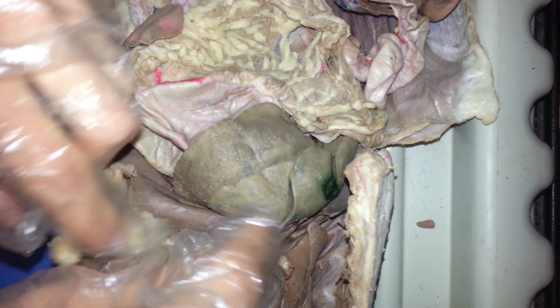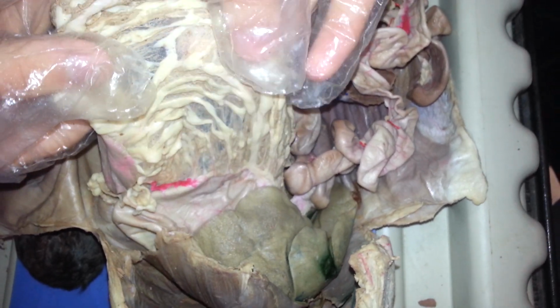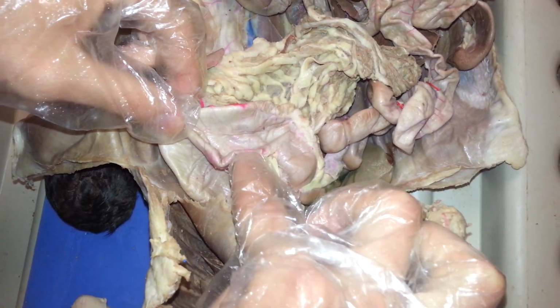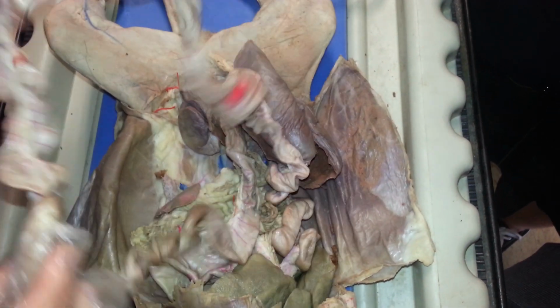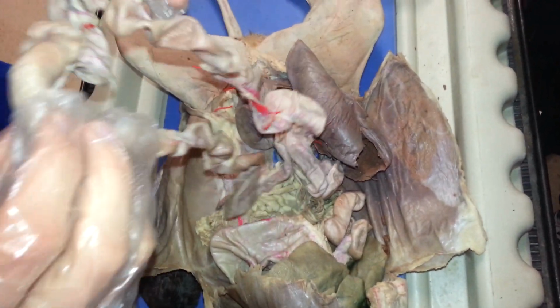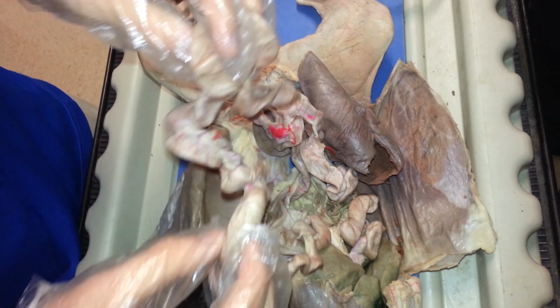Alright, next is the liver, so we're going to move on to the abdominal cavity. It's this green structure right here. And located within it is the gallbladder. It's this dark green. The greater omentum is this tissue that insulates the abdominal cavity. Next is the stomach. It's located right here. The small intestine is all of this. The mesentery is not shown here. It's cut off, but it holds the small intestines together.